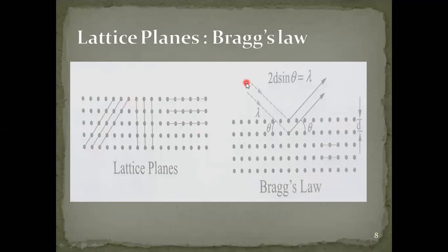Right, these are the X-rays. The incident beam is coming and is incident on one particular atom. It is getting reflected. Let us now see only reflection, not transmission. Again, what is happening? Another incident ray is coming, hitting the target, that is the atom, and again reflecting. So what is happening here? There is some angle between the two planes. This is theta, this is theta. So on the whole it is 2 theta.